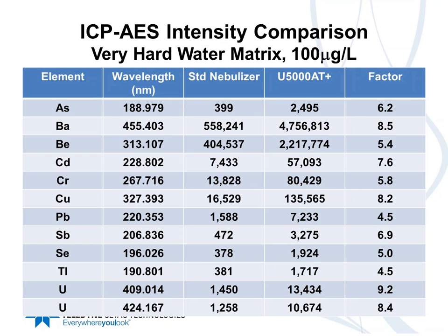Certainly, when comparing this, you can see a distinct improvement, depending upon the element, in a range of about a factor of 4.5 to 9 across these regulated elements. Particularly for the uranium lines, the weaker lines, we did see a very marked improvement in signal when using the ultrasonic nebulizer.